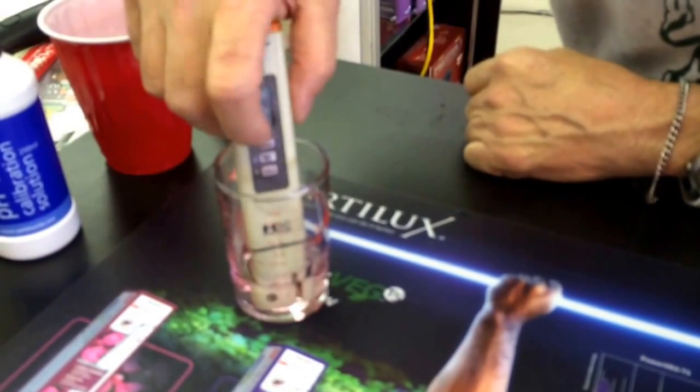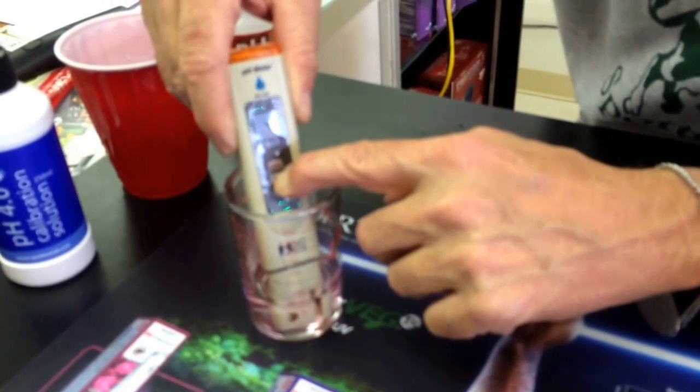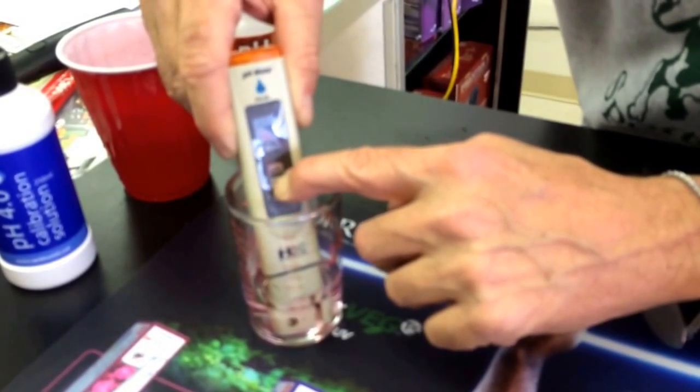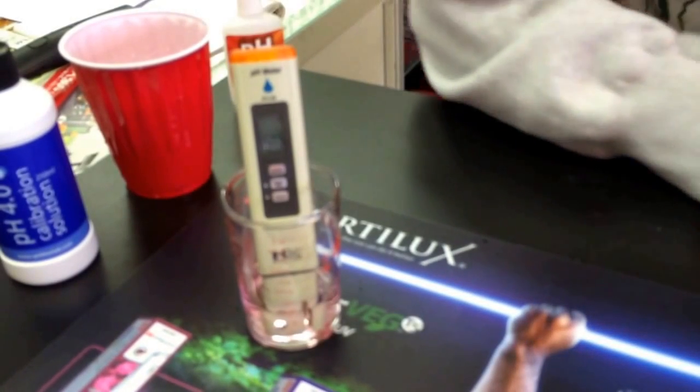We'll do it again — same thing. You just press the Calibration button in, hold it in until it starts flashing calibration, and let it do its thing, which takes another just a few seconds.